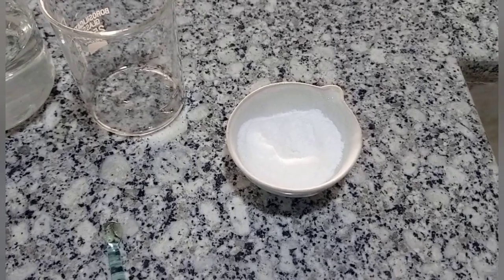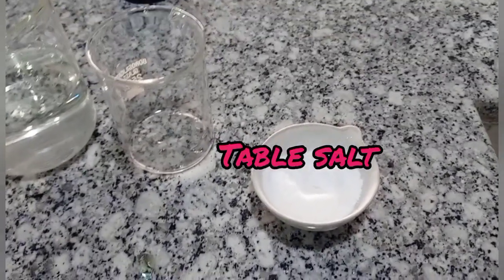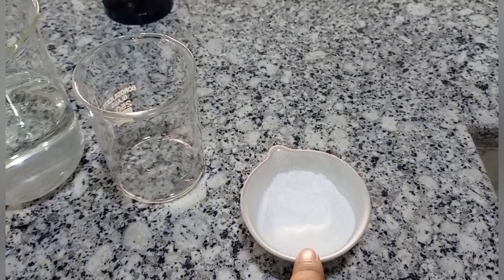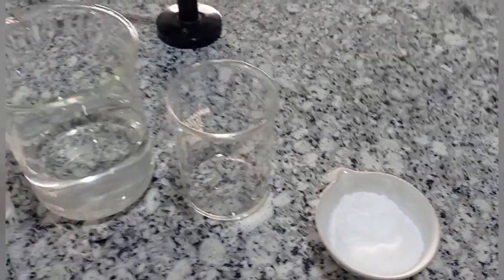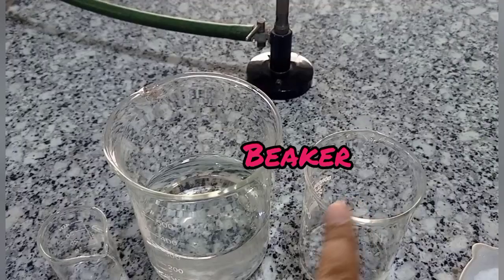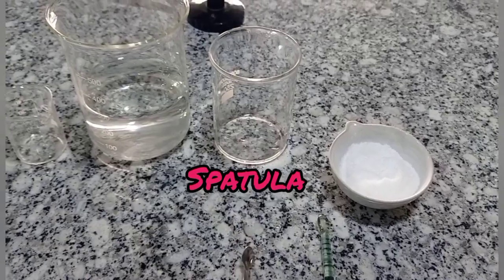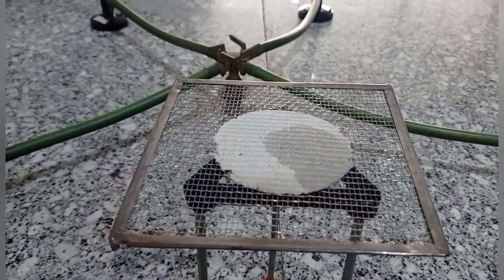Now let me show you for today's demonstration what are the things I require. Watch the video till the end and learn how to prepare supersaturated and saturated solution. For today's demonstration, I require salt. This is table salt which we normally use for eating. I have used a china dish. I require a beaker, distilled water, a stirrer, and a spatula.